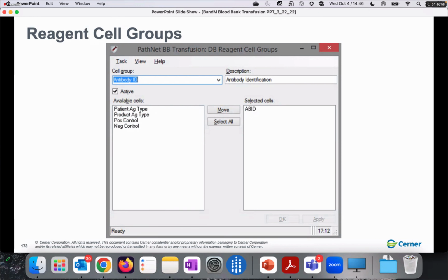And we'll talk more later about the whole reasons and reasons with meanings thing, and get into what the various different types are for. But essentially, reasons and reasons with meanings are ways of updating certain code sets, really.